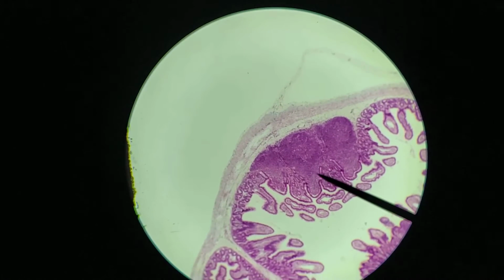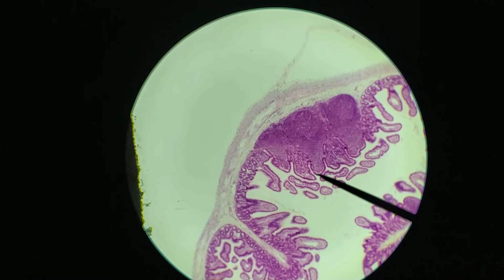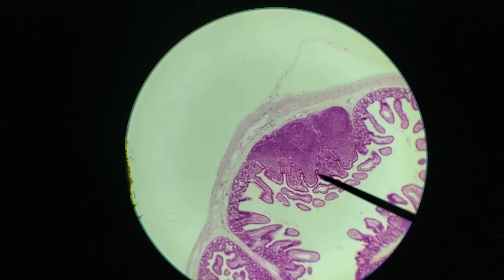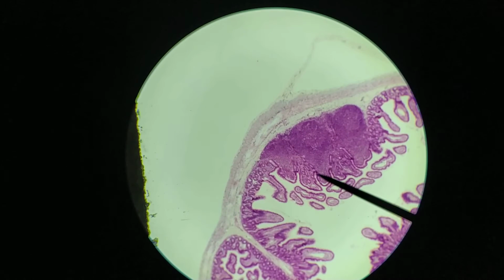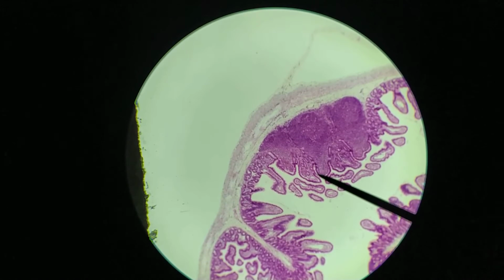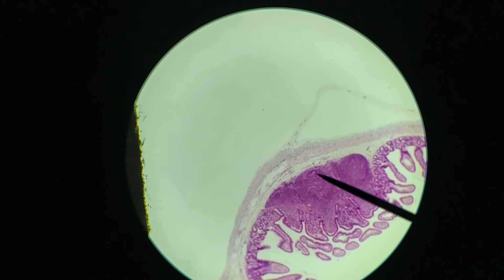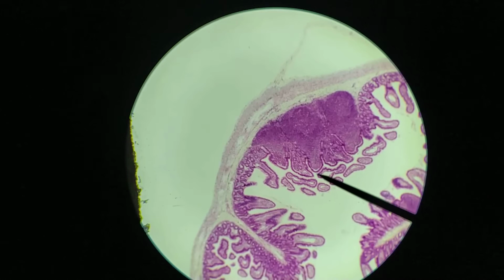Okay, and so it goes just underneath the epithelium here as well. In fact, the epithelial cells are actually also specialized. They're called M cells. And so these cells here are actually easier for pathogens to penetrate than other parts of the epithelium in the small intestine. Okay, so basically what we're doing here is we're trapping pathogens. Okay, we're allowing them to pass across so they can come directly into contact with our lymphatic system. Okay, so right there we have lots and lots of lymphocytes and macrophages and so on. So we can mount an immune response right here to any pathogens that pass across this epithelium.